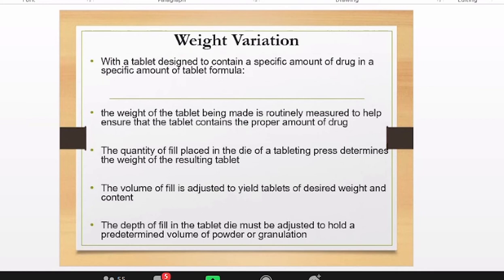But when you are doing the test, you must recognize that if you put the tablet in the disintegration fluid or dissolution fluid, after a period of time, if you cannot find any particles around, as the tablet doesn't appear to have broken apart, you simply check whether you've got a soft mass of that tablet. If you have a soft mass and you do not feel any hard components within the tablet, then you must consider that that tablet has disintegrated. That's the standard rule in disintegration testing.